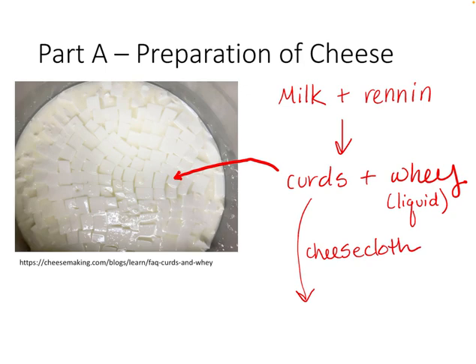And then we're going to weigh the curds and see how many curds we produced, or the mass of curds that we produced. Now, at cheese factories, they actually take the curds, they let them dry further, they add salt and do some other things, and that's what leads to the cheese that we buy at the store.